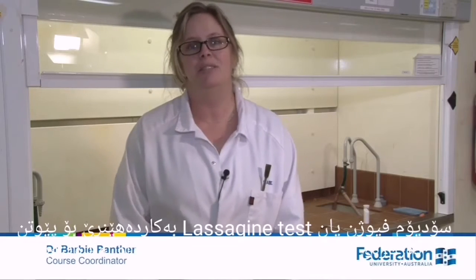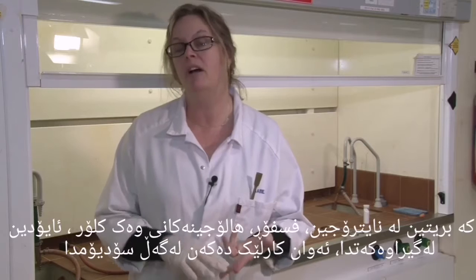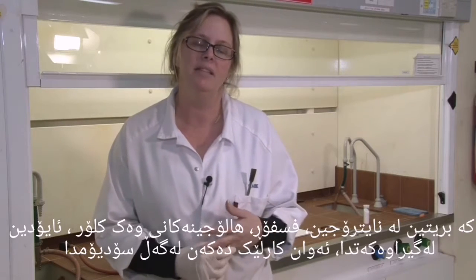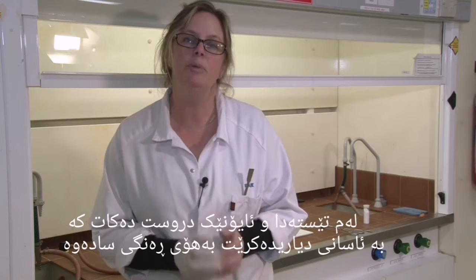The sodium fusion test, or Lassaigne's test, is used to tell if there's any heteroatoms in your unknown compound. If there's any nitrogen, sulfur, or halogens like chloride or iodide in your compound, they'll react with the sodium in the test and form ions, which we can easily detect with some simple colorimetric tests at the end.